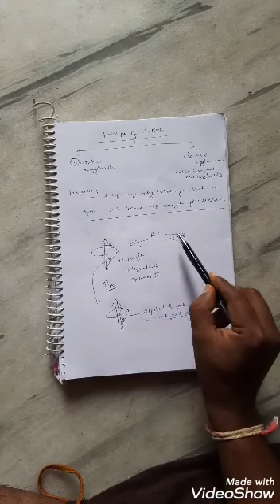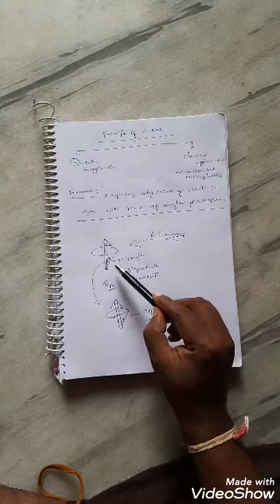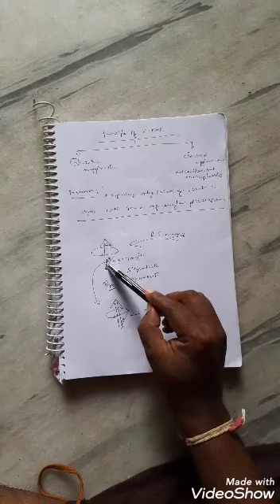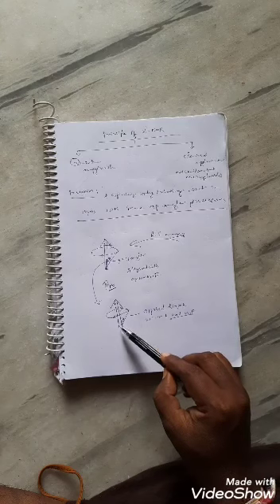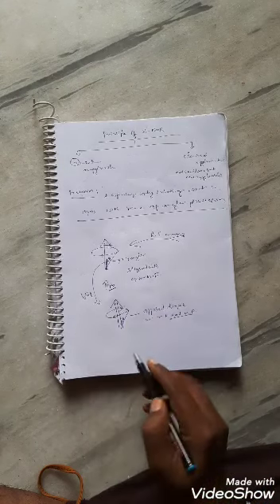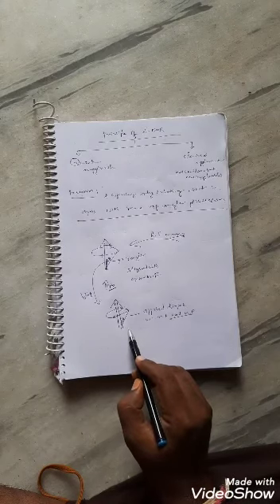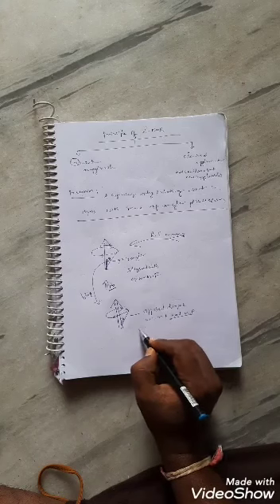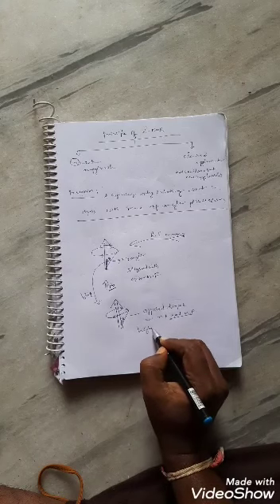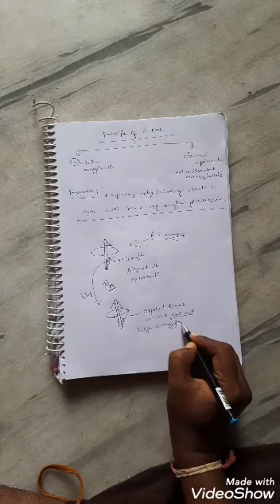And when you give some external RF energy, the energy increases and this will flip and rotate in the opposite direction, and it is a high energetic precession now.